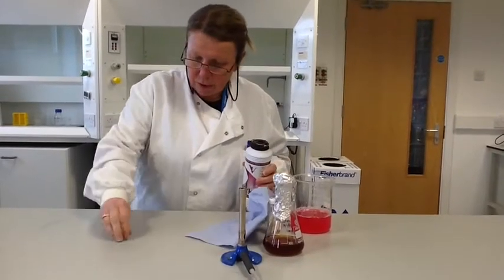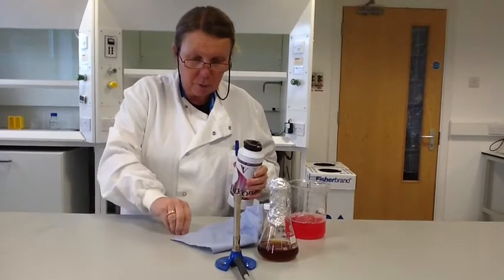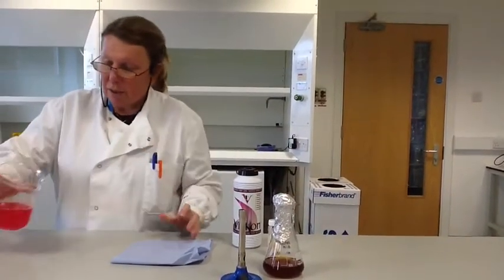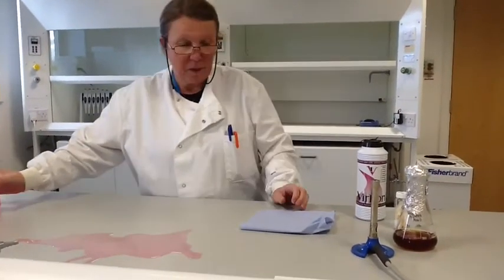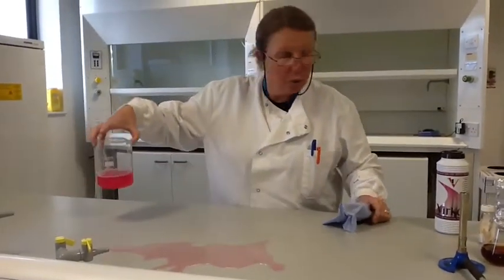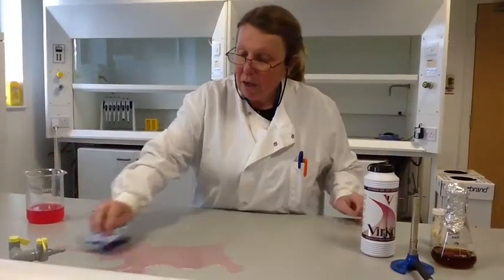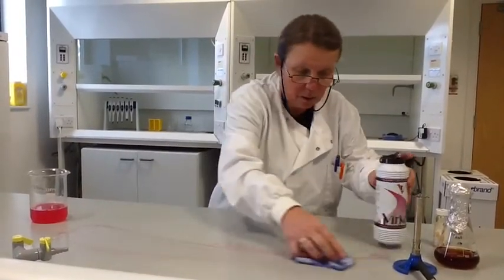We're going to do some microbiology today. The first thing we have to do when handling microbes is to produce a sterile area so that we don't contaminate our work and don't endanger ourselves. To produce a sterile area, we've got a 1% solution of Virkon disinfectant, which is very strong and commonly used in laboratories. We're going to swab that over our bench to make it nice and wet.